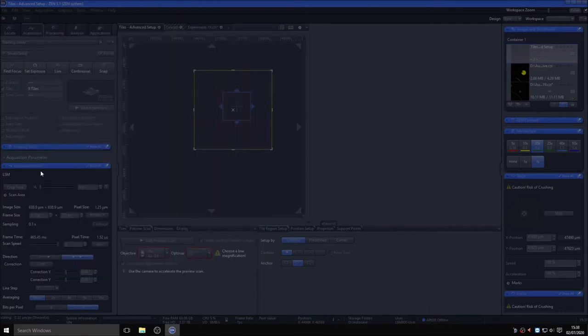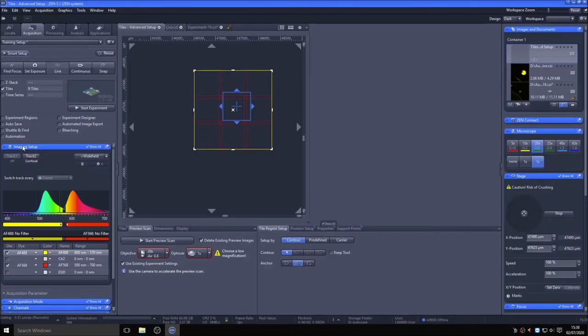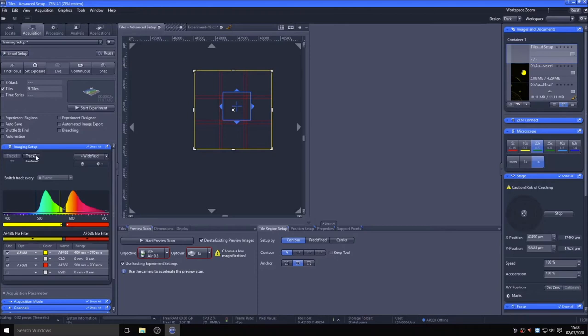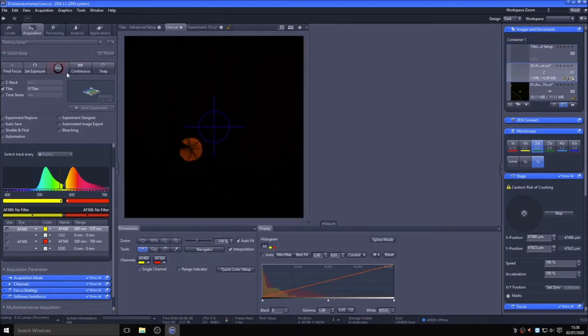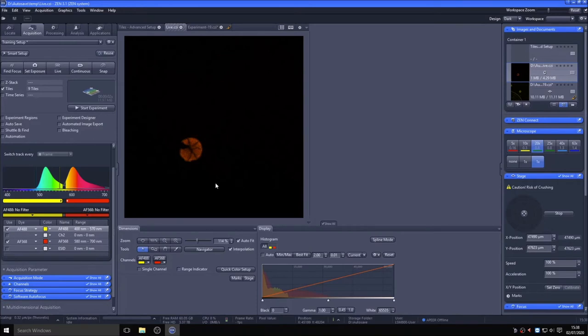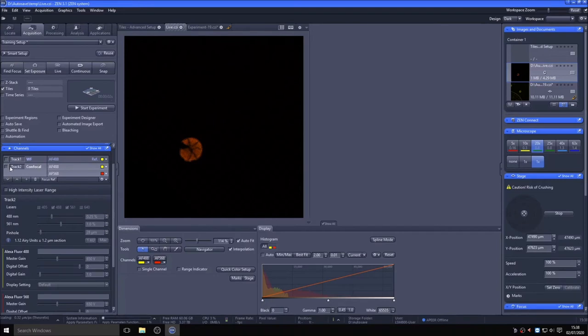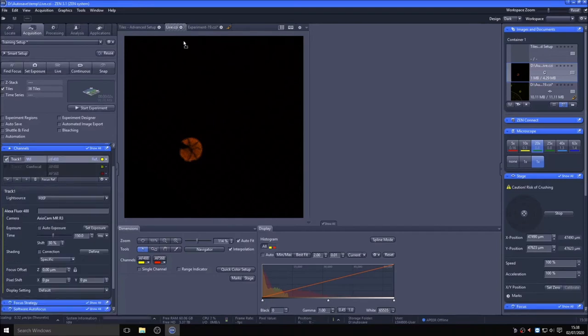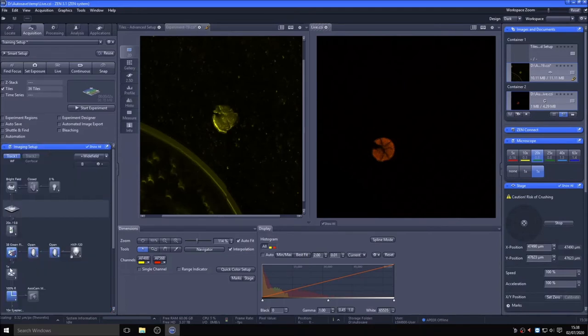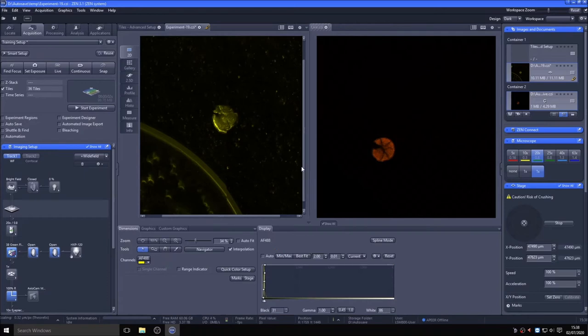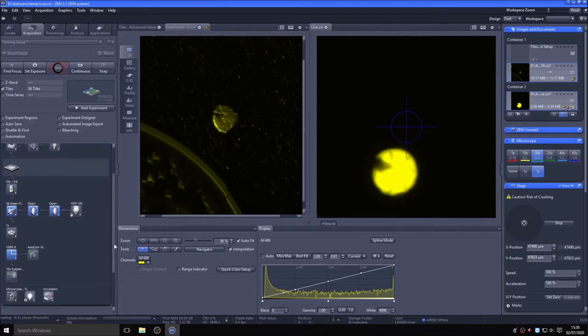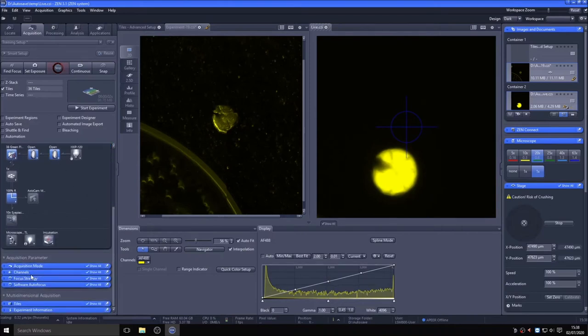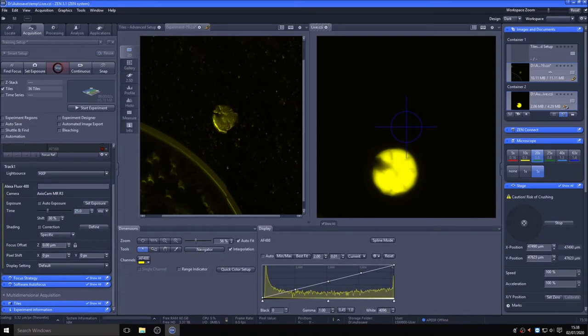If you look back at your imaging setup now, you will notice that the wide-field track is not selectable, and going live still uses the scan head. If you go into the channels menu and deselect the confocal track, it will now allow you to select the wide-field track. You can now utilize the camera on the system. Going back to imaging setup, you can see the system is now using the GFP filter cube and the HXP fluorescent light source. Going live, you can now see we need to decrease the exposure, in this case down to 25 milliseconds. It's a good idea to refocus at this stage, as the camera and confocal scan head aren't completely parfocal, and then update the Z position of the tile region.